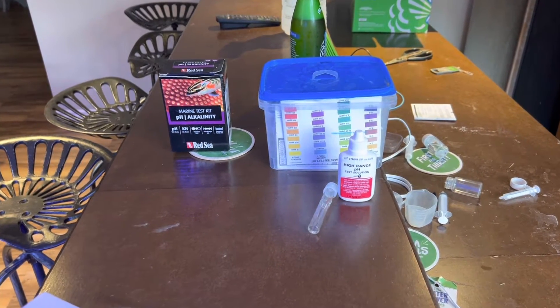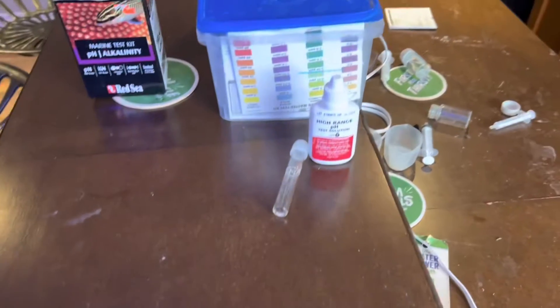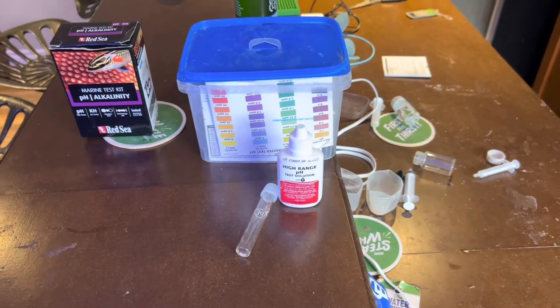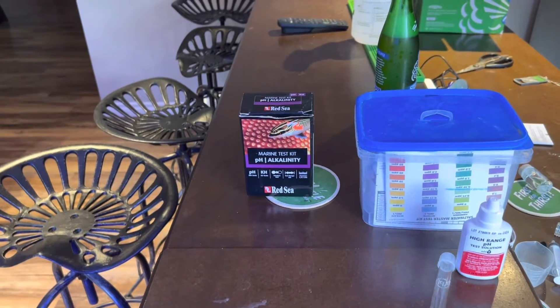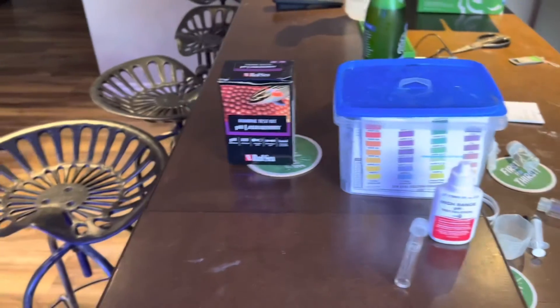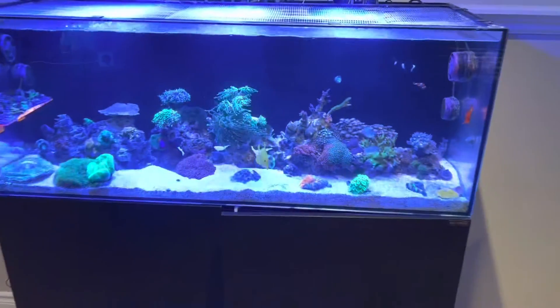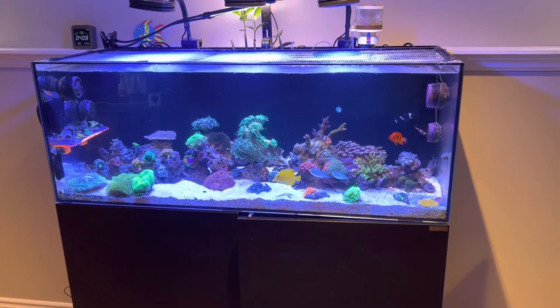Hey everybody, Ricky Bobby, how's it going? Are you sick of these API test kits for pH and alkalinity? Any of these kits and trying to figure out what your numbers are — test this one, test this one, the numbers don't jive. You have something like this at home and you want to make sure your numbers are all legit. I've had enough of this.